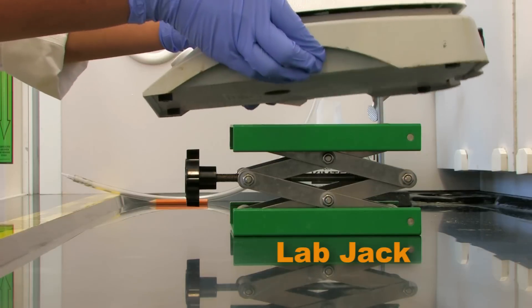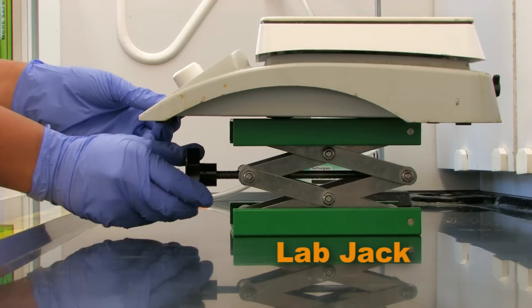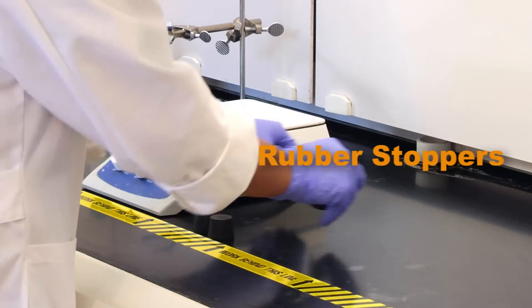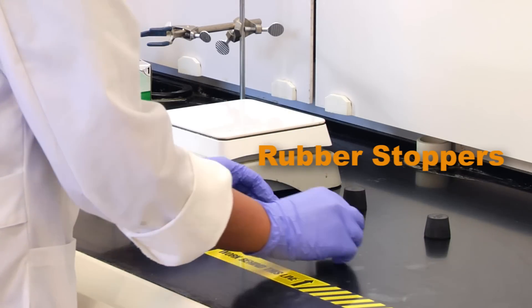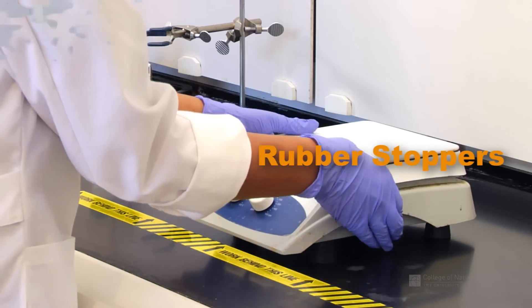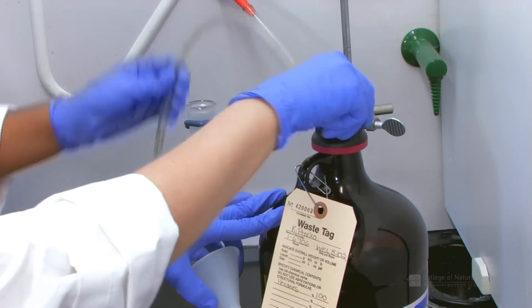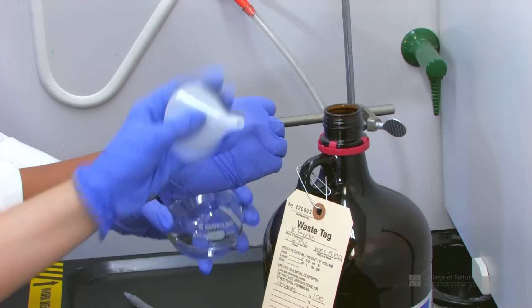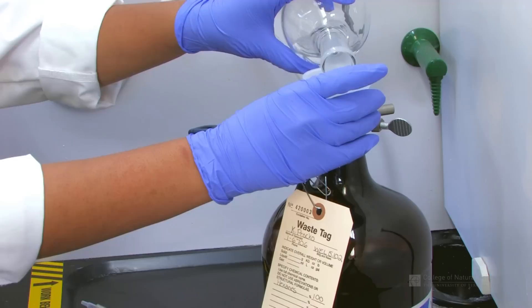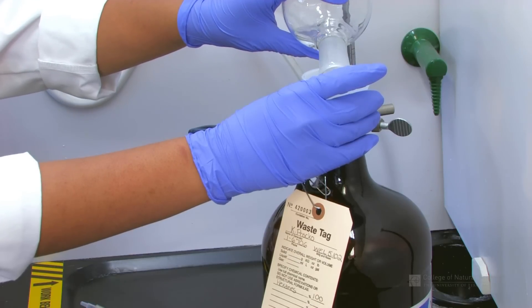Large equipment should be raised by about two inches to promote air flow below the equipment. This can be achieved using lab jacks or by putting rubber stoppers under the four corners of the equipment. Open bottles of chemicals or chemical waste should not be stored in the hood, and chemicals should not be evaporated in the hood as a method of disposal.